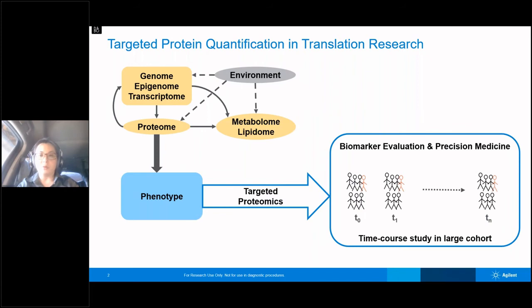To achieve this goal, standard flow LC-MS is typically a better choice than nanoflow and microflow LC-MS. The Agilent 6495 triple quadrupole LC-MS coupled with the Jet Stream source has been well accepted by the market for targeted proteomics. But sometimes researchers cannot get enough samples, so they only have a very limited amount of sample. This is the reason why we would like to evaluate Evosep One coupled with Agilent 6495 triple quadrupole to complement our current standard flow LC-MS system.